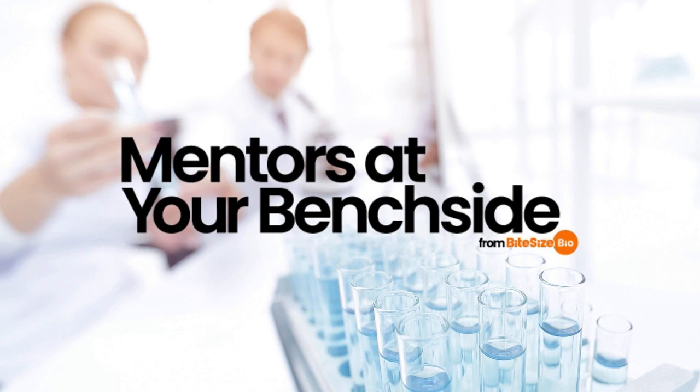Bite-sized Bio has several articles on routine calibration, including routine calibration of pipettes and calibrating your lab scales. Links to these articles are in the episode description. Tip number 2, conduct routine maintenance.